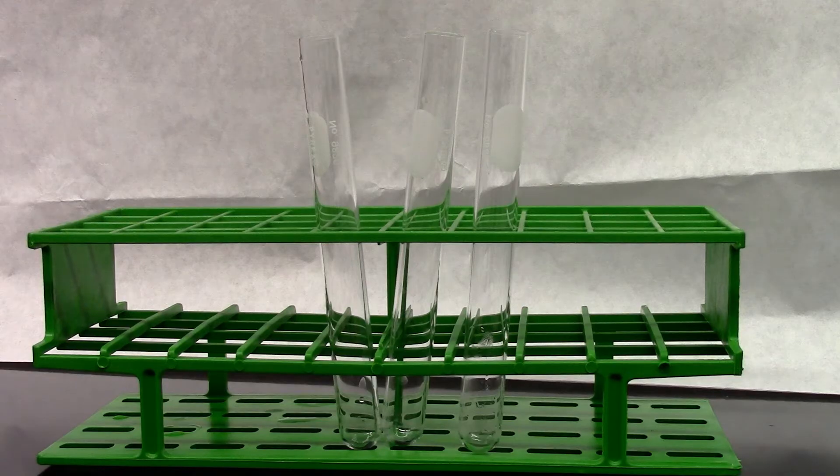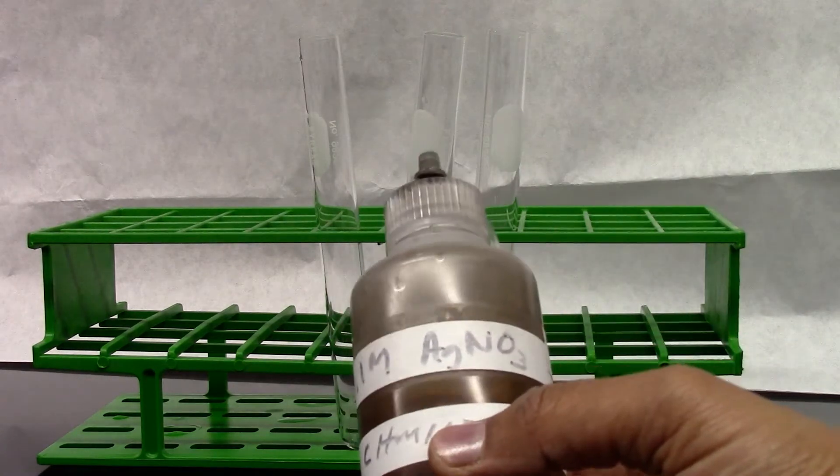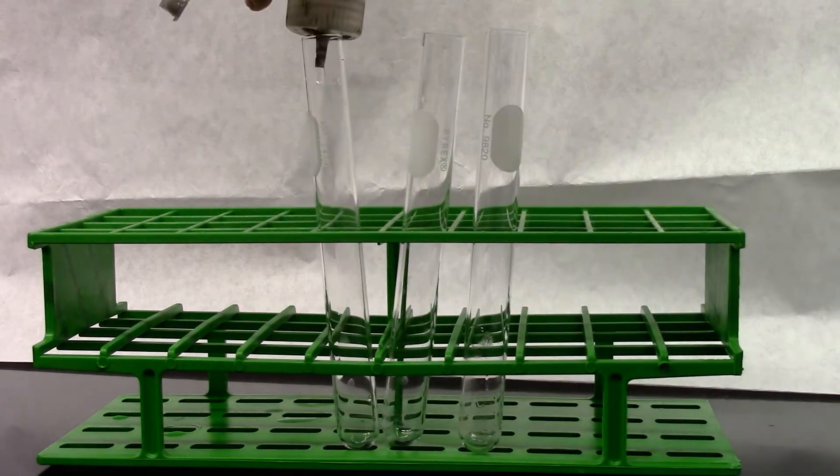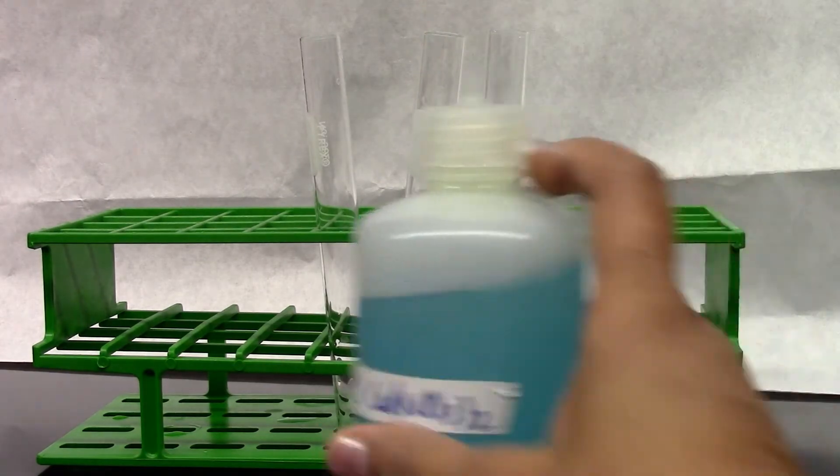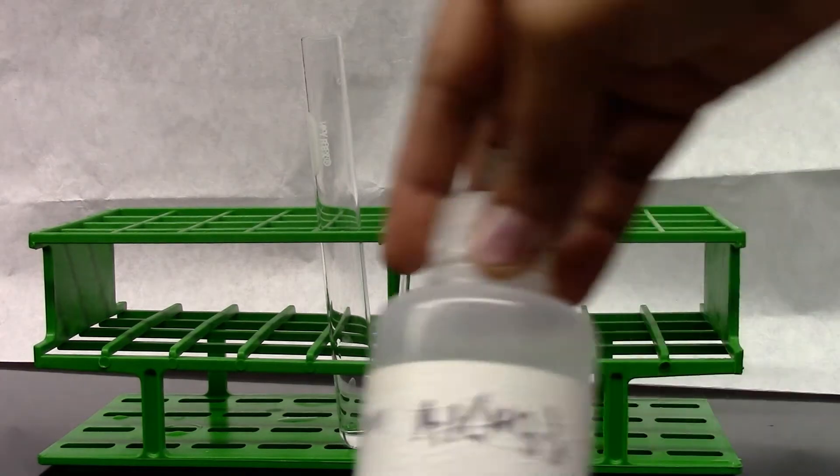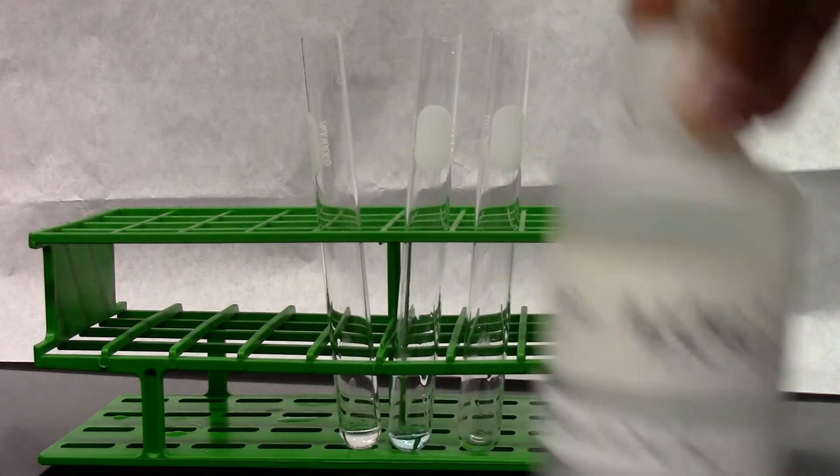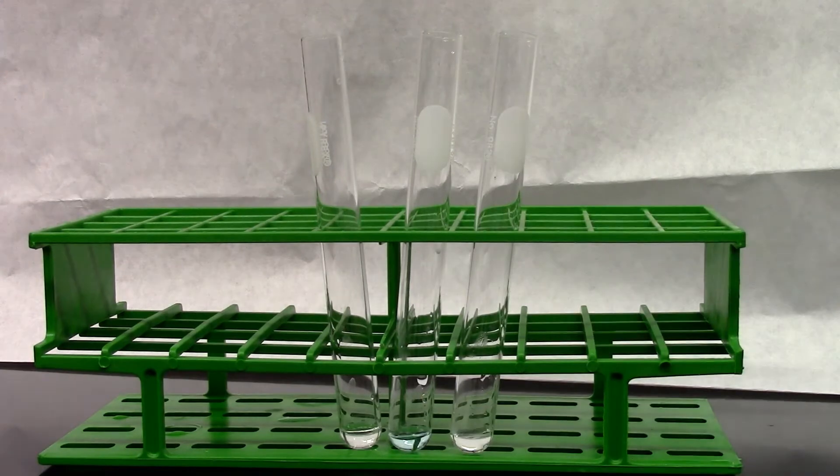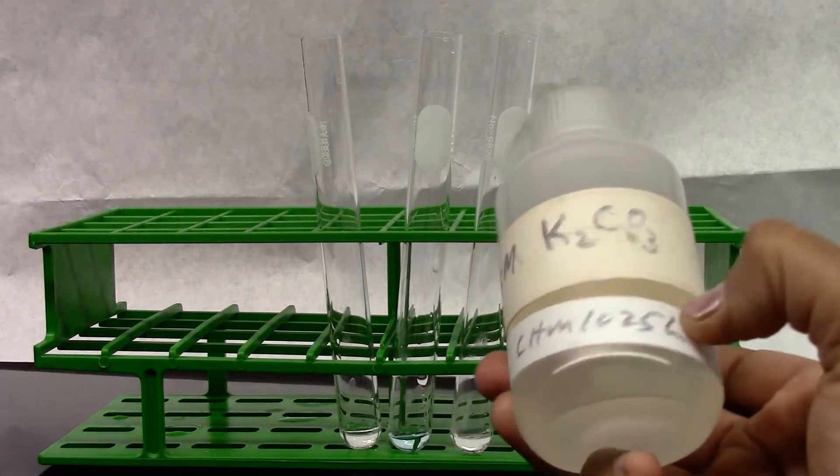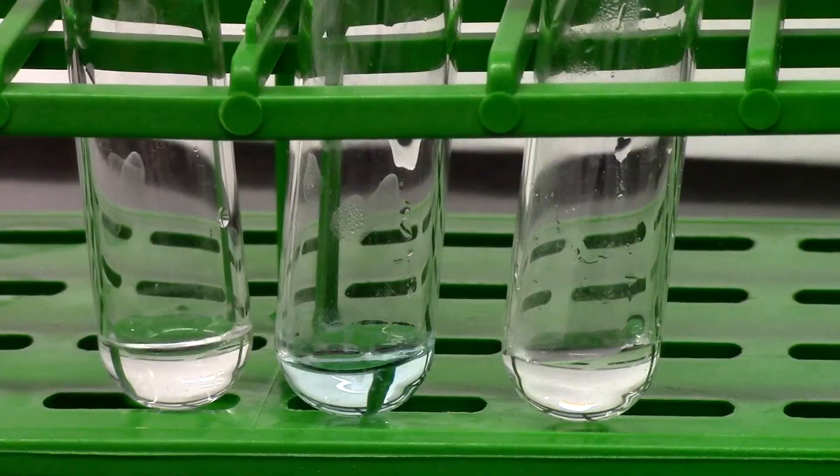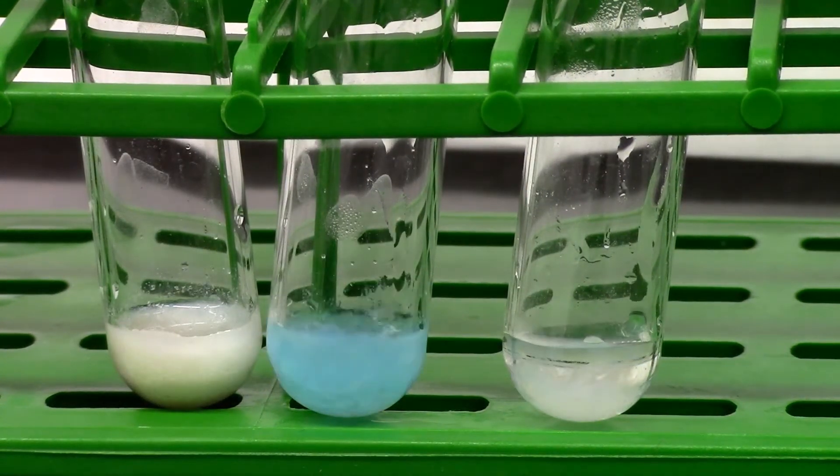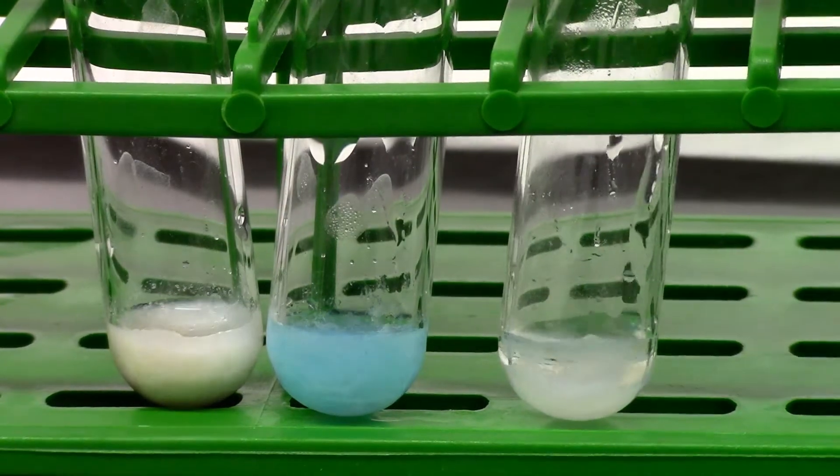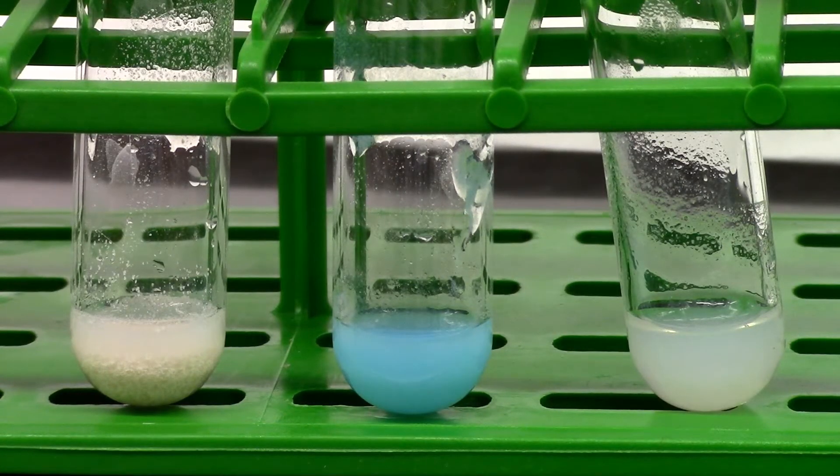So for part D I have three test tubes. The first one I'm going to add 10 drops of silver nitrate. The second test tube I'm going to add 10 drops of copper nitrate. The third test tube I'm going to add 10 drops of aluminum nitrate. To all these three test tubes I'm going to add a few drops of potassium carbonate. And all three solutions have precipitate.